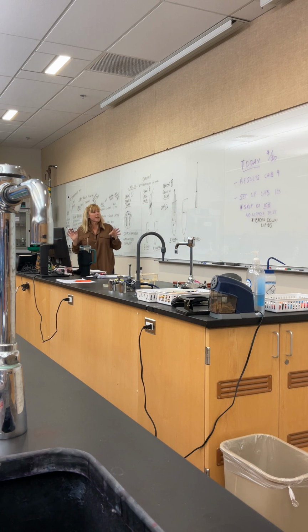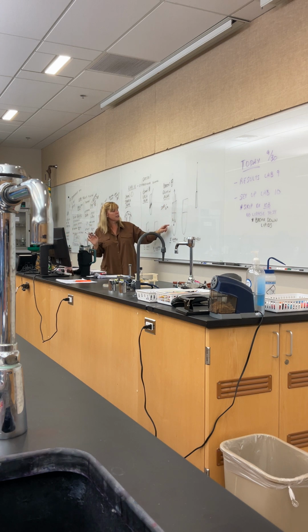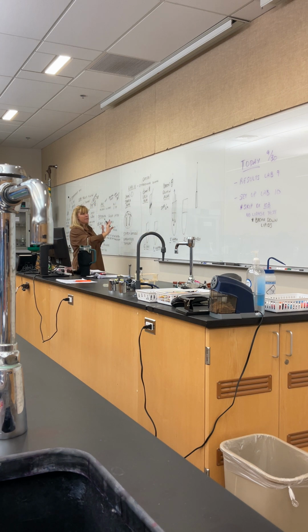Now, another thing I want to keep in mind is if I'm stabbing to 3/4 of the media, I need to make sure I flame sterilize my needle long enough. Not just the tip, but long enough to cover how deep it's going to go into the media. Once I'm done with this, everything's going to get labeled. Remember, our tubes get tape on them for the labeling, and they're all going to go into the incubator.